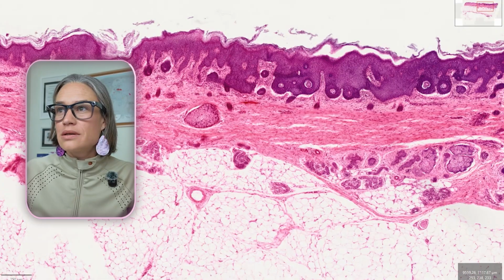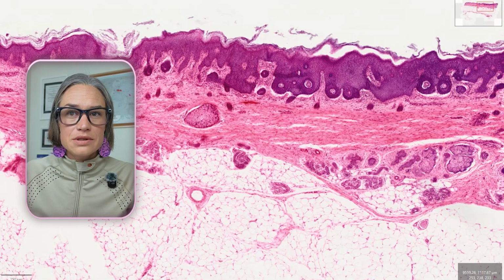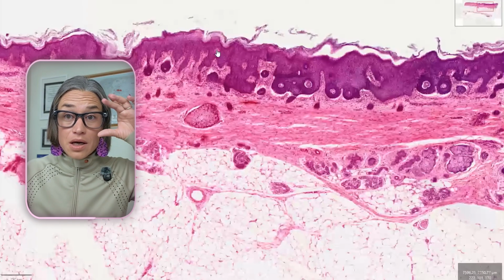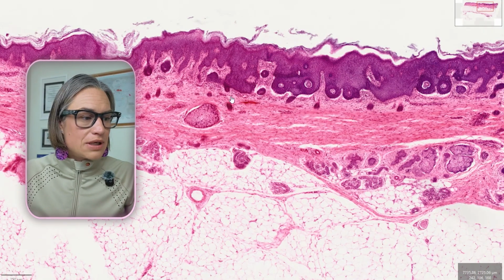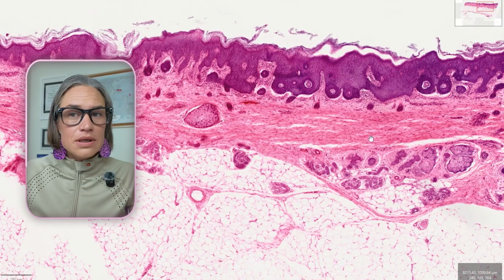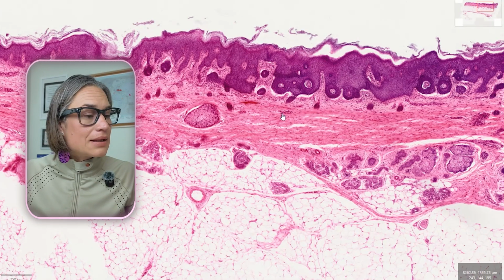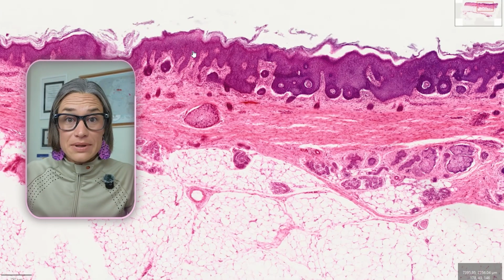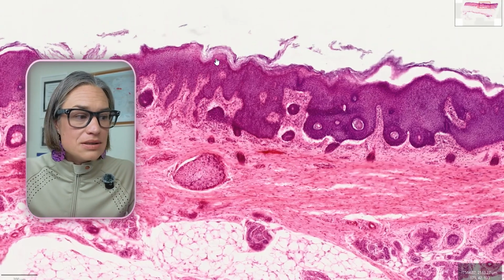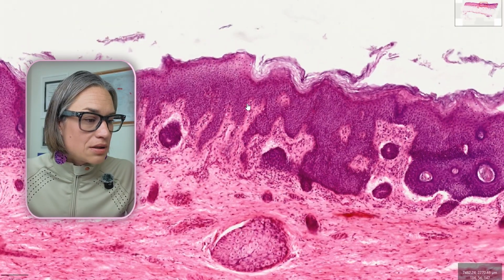This is going to be covered in the next live stream, but let's just look at the overall pattern, right? What do you see? We saw the surface. This is the epithelial layer, and underneath, we already named, this is the connective tissue. And this is already telling us something, that this is not simple epithelium, right? Here we have multiple layers. And let's zoom in. Why do we need multiple layers?